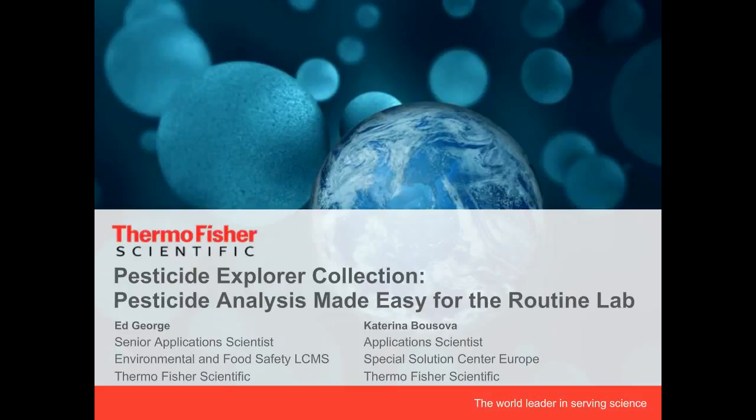Good morning, good afternoon. Thank you for a nice introduction. And at the same time, very welcome everyone to this webinar giving details about the Pesticides Explorer collection. It's a package focused on a routine multi-residue method for determination of LC amenable pesticide compounds using traditional QuEChERS sample preparation, followed by different instrumental techniques.